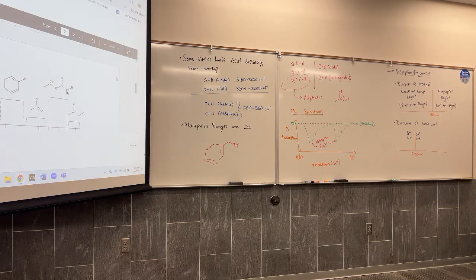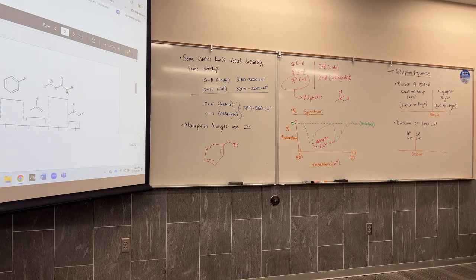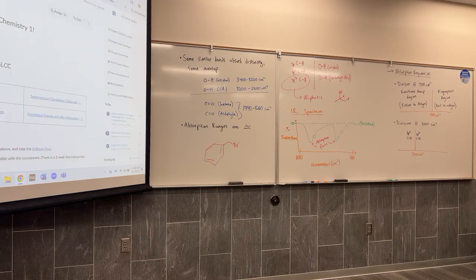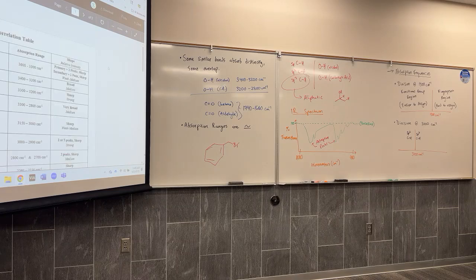On the other chart, the aromatic overtones, aromatic ring looked really, but I guess I don't really know. What is the difference? I think one was like 1600 and then one was like a range.